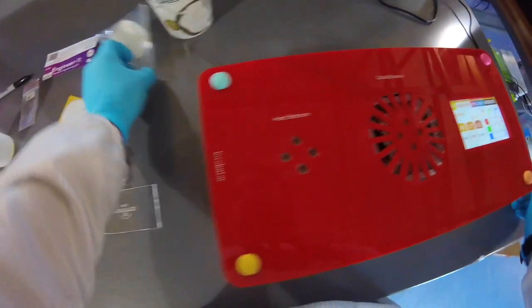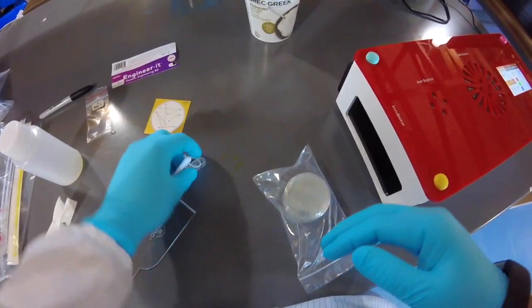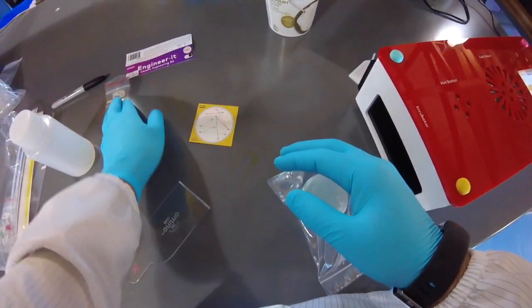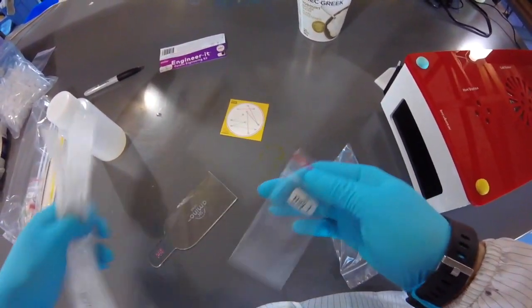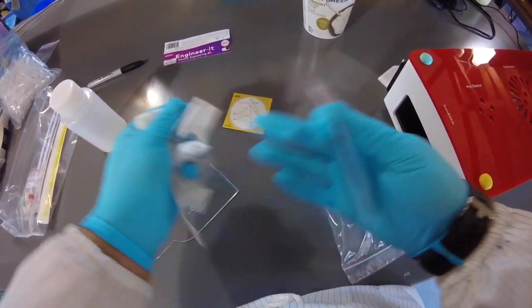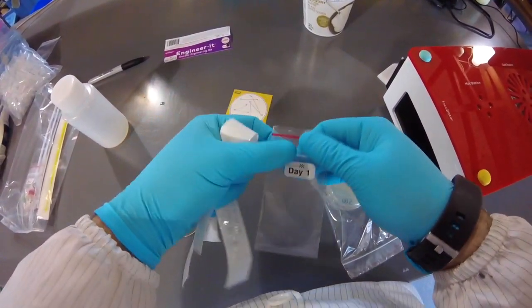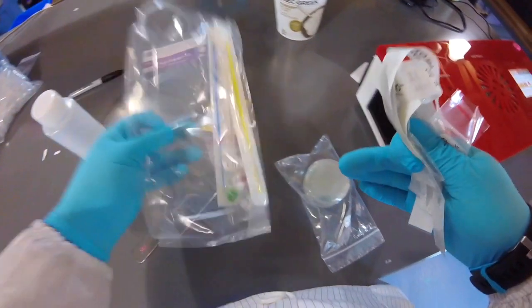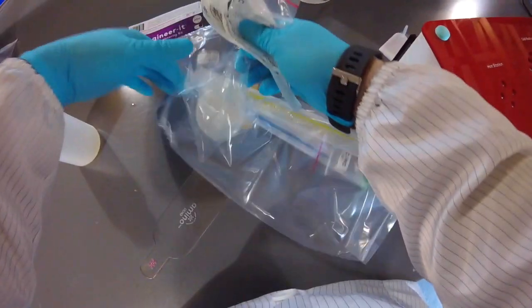You can put your Petri dishes in the fridge. The stencil you can hang on to for later use. You're done with the day one bag. All of the loop packaging can go into the regular garbage because it shouldn't have touched anything. And this little baggie can go in. The rest of this can go actually into the fridge.